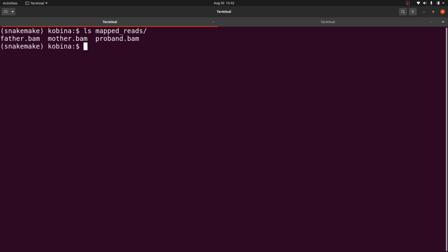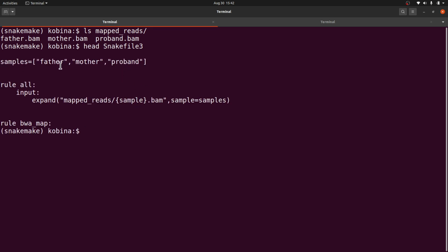Now, if we take a look at the script we used, let's say head Snakefile. Okay. We specify the samples here. Sometimes you can have tens of samples or hundreds of samples. So in that situation, this approach may not be the best. So there's a workaround. If you have a situation like that, you can reach out to me and then we can look at how to do that as well.